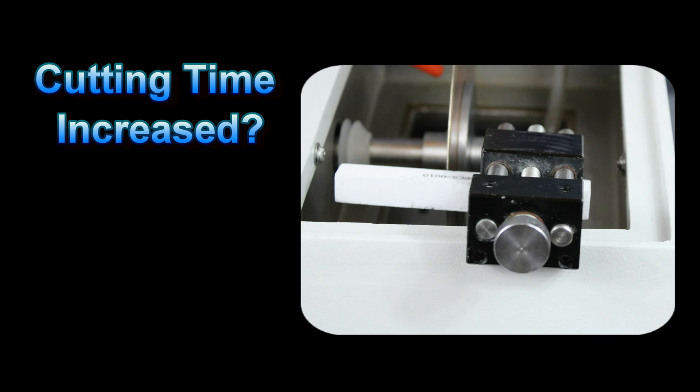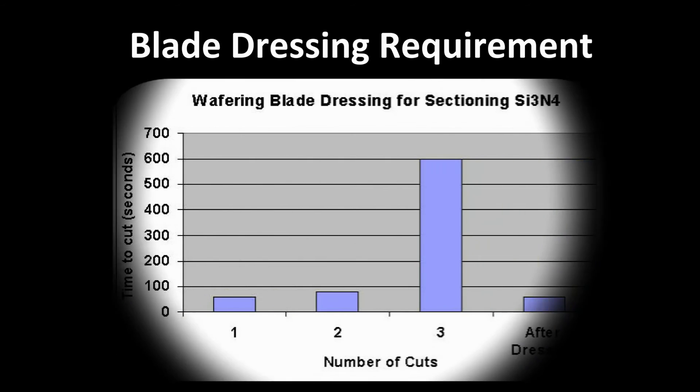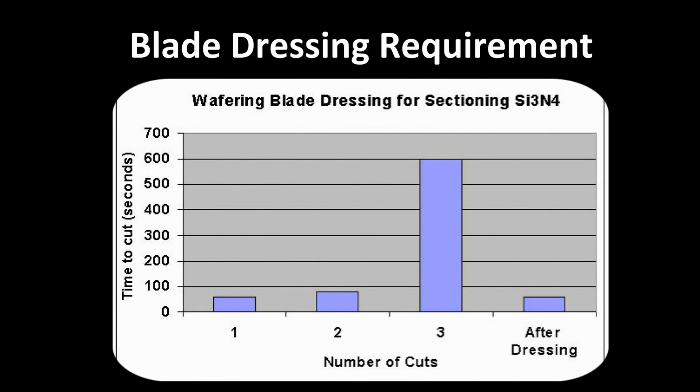We have already briefly discussed dressing the blade. However, if you are seeing a significant increase in the time required to make a cut, it is a good indication that the blade may require cleaning or dressing. Here is an example of cutting a very hard silicon nitride sample. Many would think that since this is a ceramic material, the blade would not need to be dressed, as the sample itself would not smear over the abrasive.